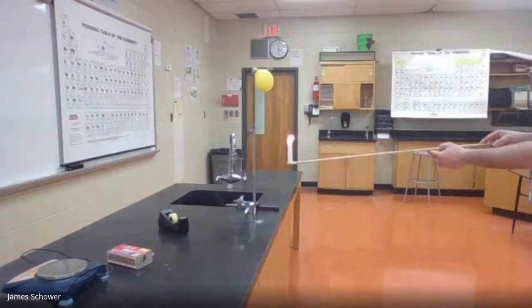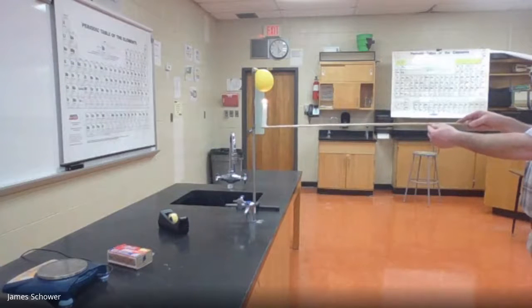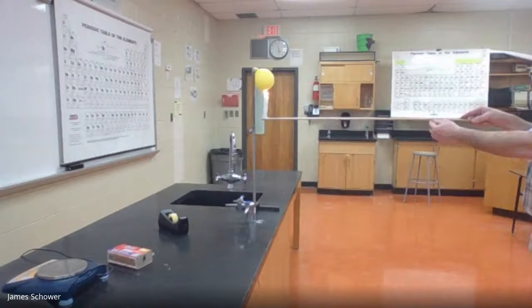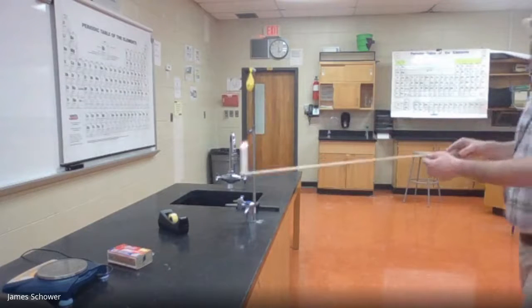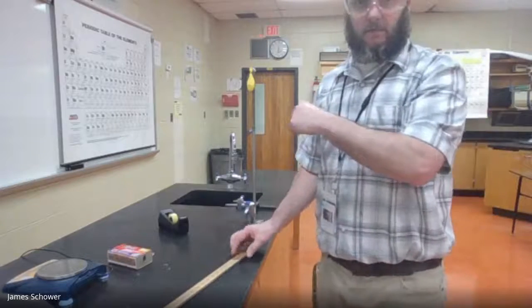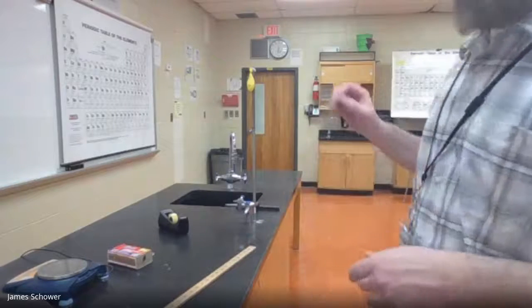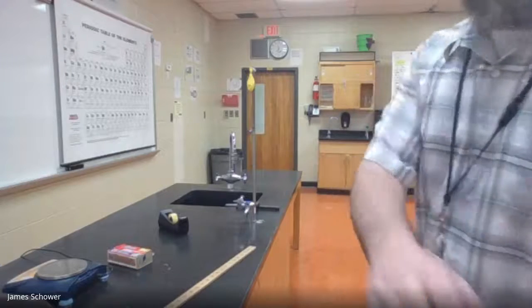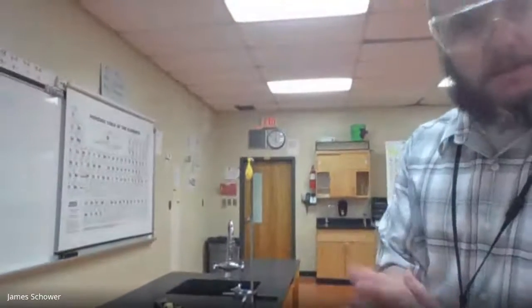And then proceed to light the balloon. Now there was hydrogen gas in there so that was direct evidence. Short flame but the gas exploded or combusted very rapidly. All right guys, so that's your check to see if you have generated hydrogen gas and you can see we did.